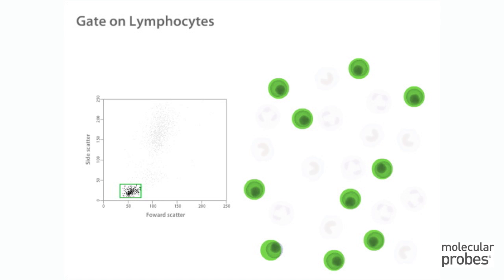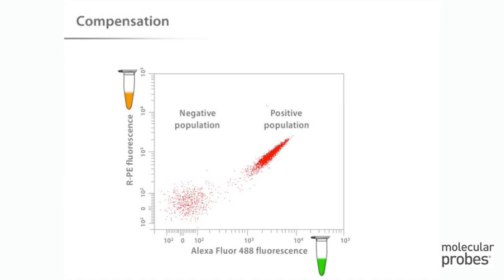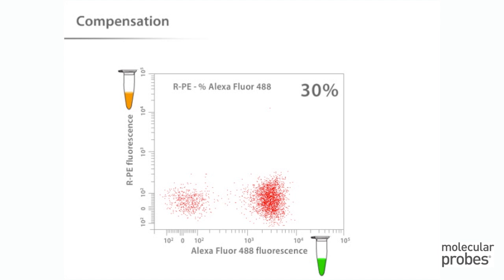Remember that each dot represents a cell and each cell has associated with it all data for scatter and fluorescence. By designating a region in this way, we can look at the various fluorescence and scatter properties of only the cells within the region using subsequent histograms and dot plots. Before proceeding further with analysis, we need to set compensation. Gating on lymphocytes and using data from the three single color controls, we can draw two-color dot plots of each color combination. This allows us to adjust the compensation so that the Alexa Fluor 488 values of the positive and negative populations in the RPE channel are about equal.